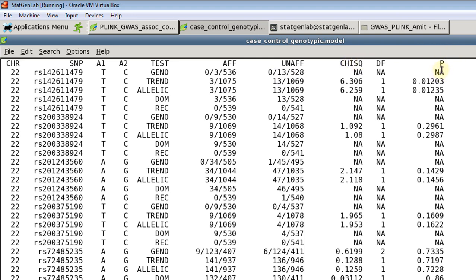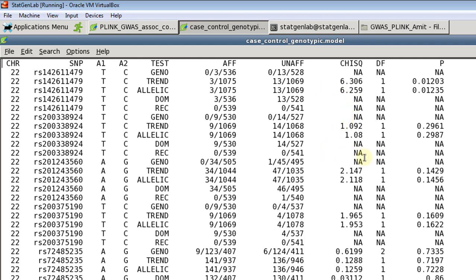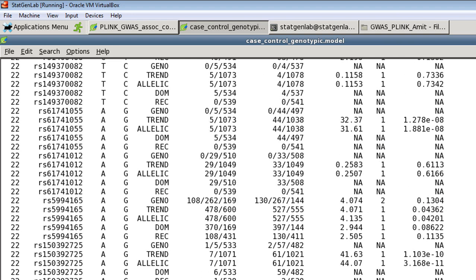Now you will observe that there are lots of NAs here. The reason behind it is Plink will only perform analysis if all the counts here, all the genotypic counts for cases and control both, are above five. So if you have any value five or less than five in either affected or unaffected, Plink does not perform a test. So then you will get NAs for that for dominant, recessive and genotypic tests. So that's why you see lots of NAs. So for typically low allele frequencies it does not perform those tests.